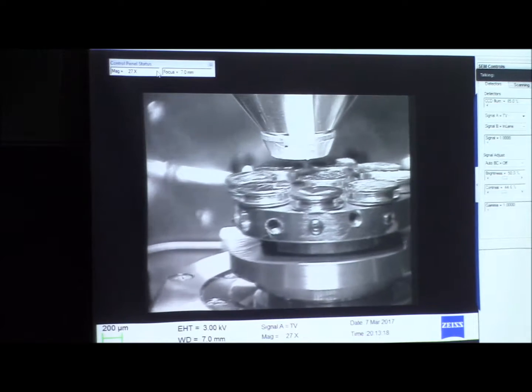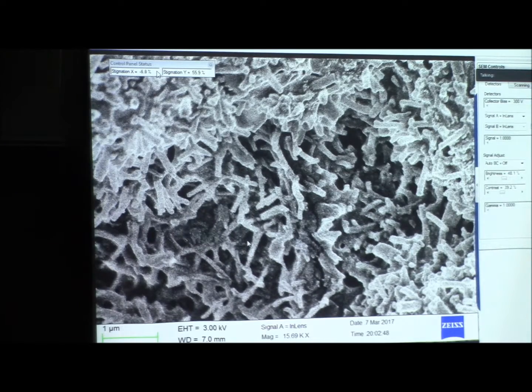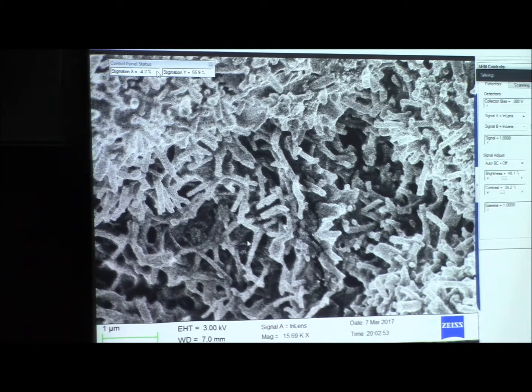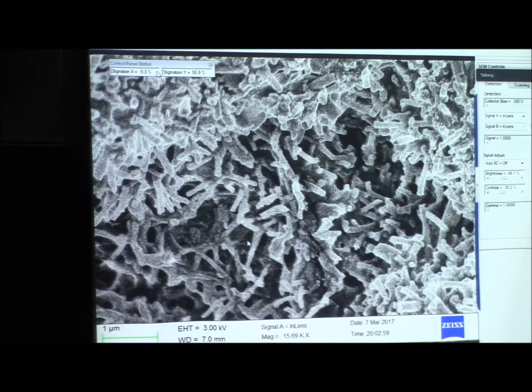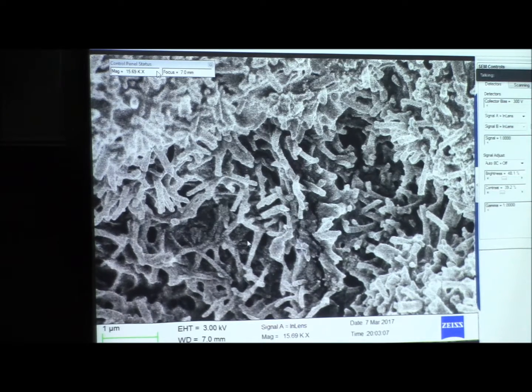Hello, my name is Martina. Hi, Martina. How's it going? Good, how are you? Let's see, I'm correcting for the astigmatism aberration right now. Sometimes it's easier than other times. Okay. All right.